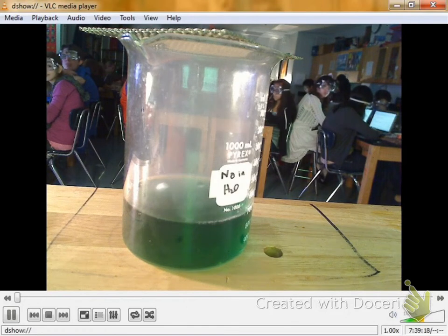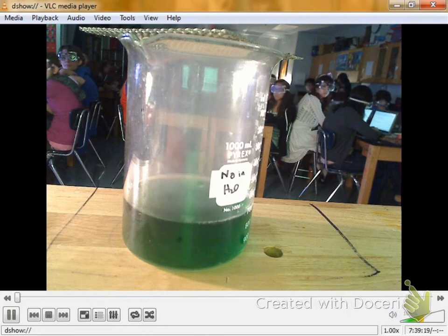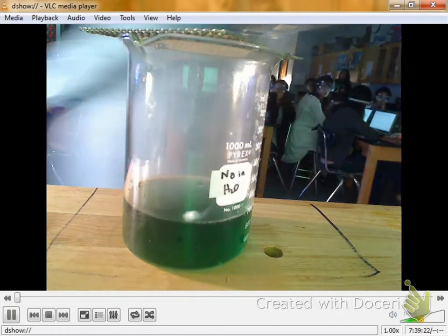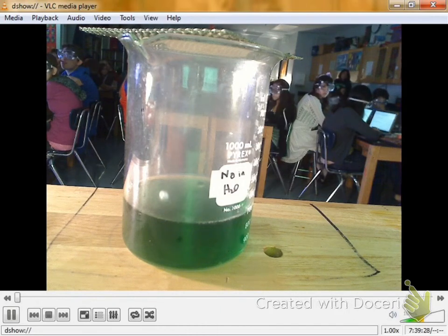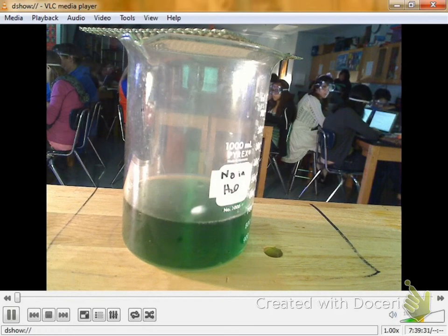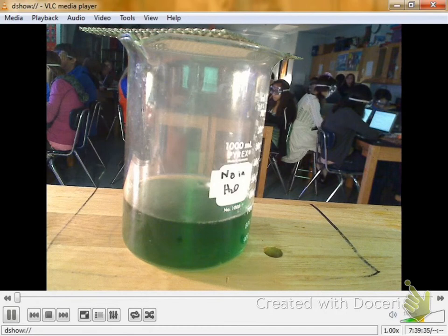Alright, all day long it's not on fire. This one's sodium. I don't want it to catch on fire. They can catch on fire. It's disintegrating. Dissolving? Yes. Hey, bonus. So water sets it on fire.